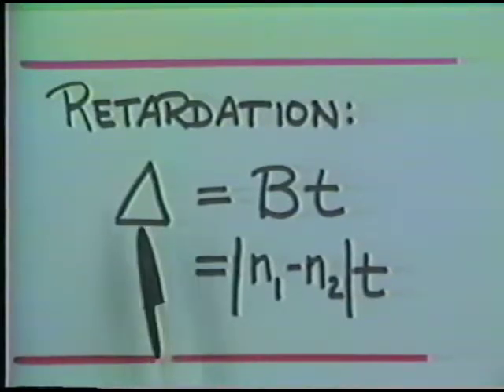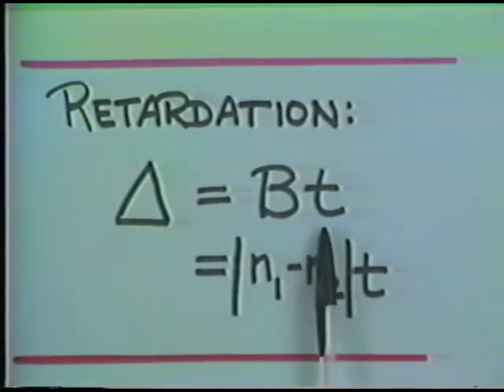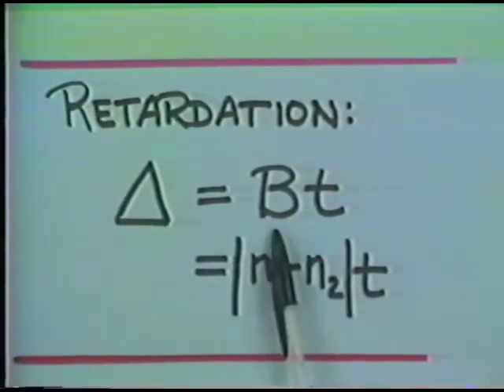Now, it's possible for us to estimate with very good precision the retardation that a particular mineral grain is showing. And we do this by looking at the interference color which the mount or the particular mineral grain shows. And if we then have an estimate of the thickness of our mount, it's possible for us to also infer the birefringence of the mineral in that particular orientation.